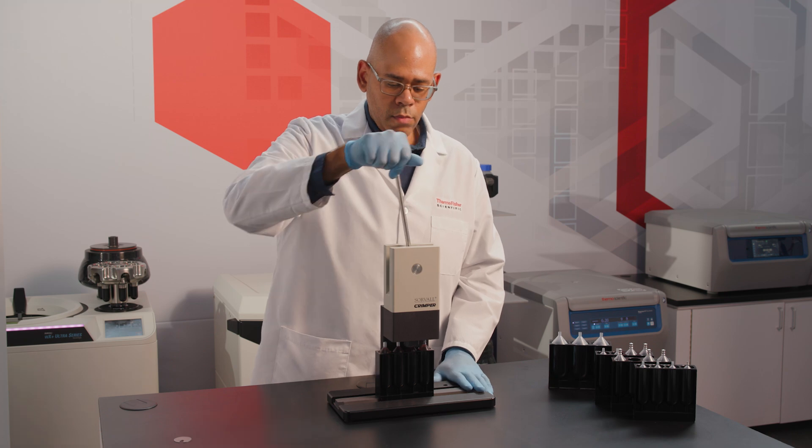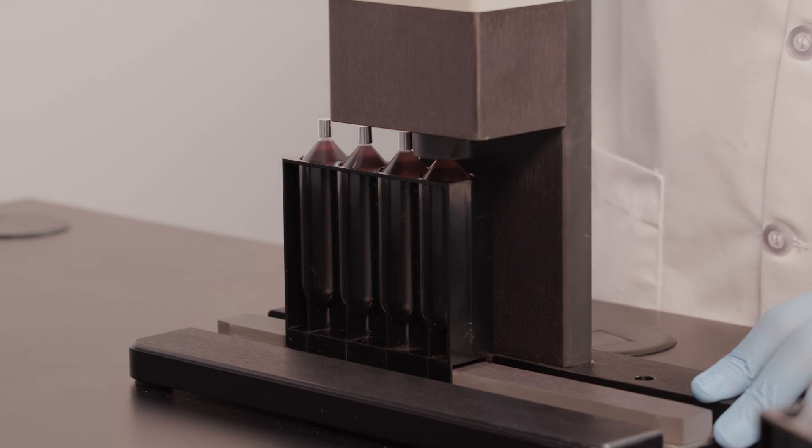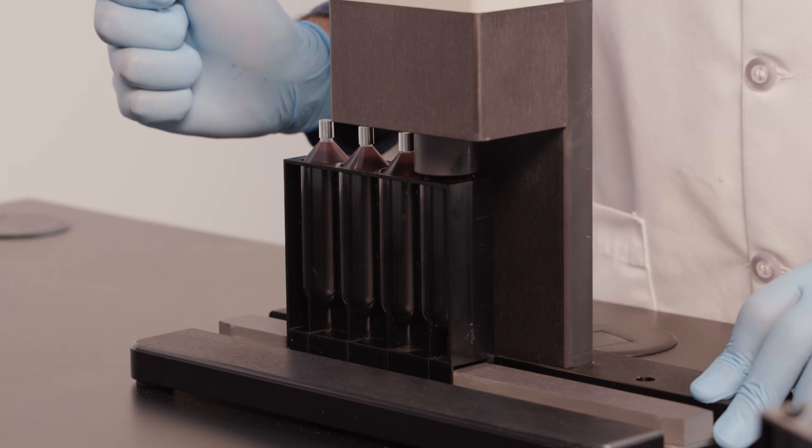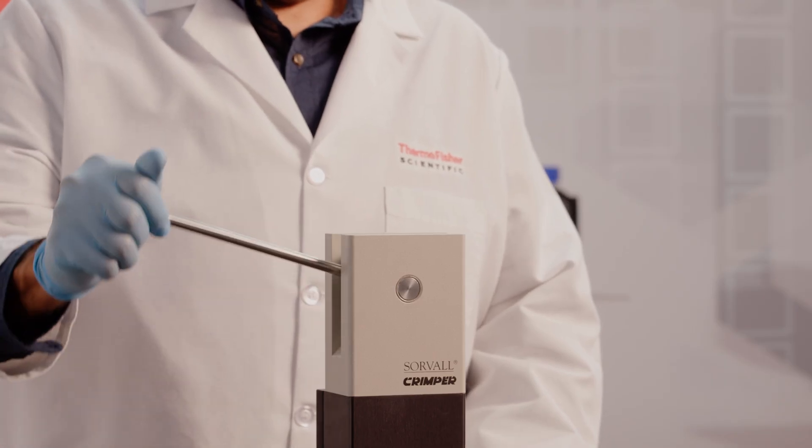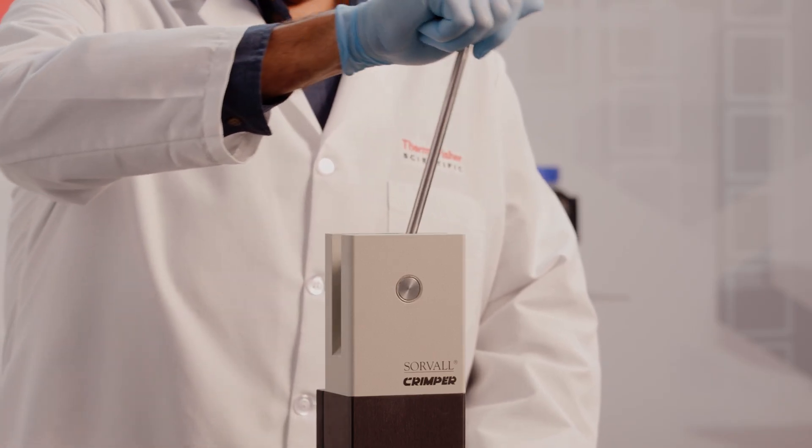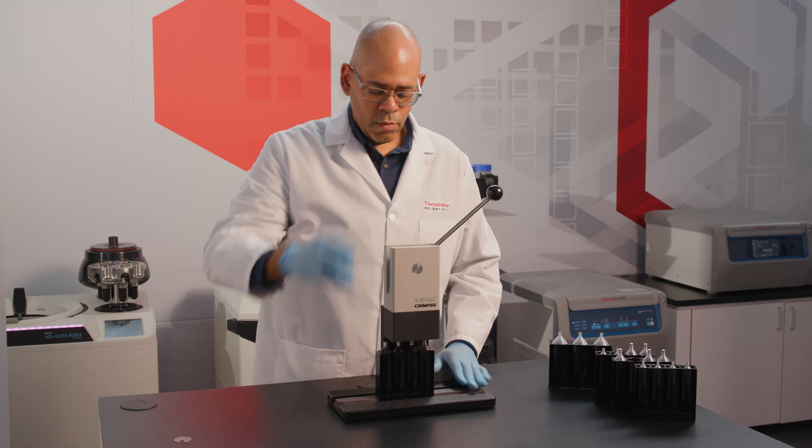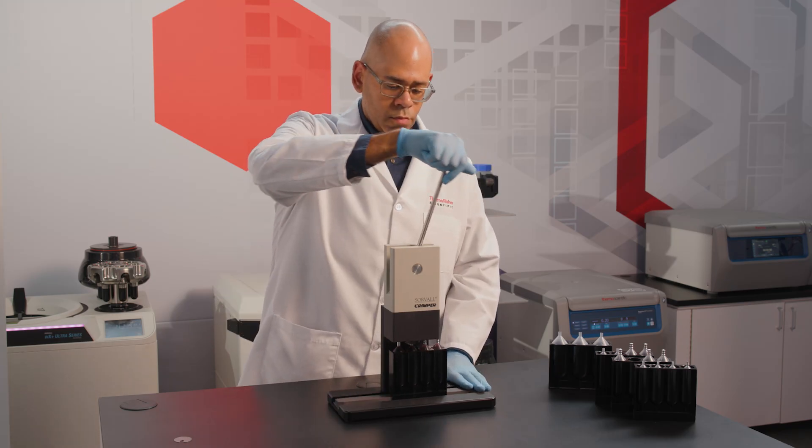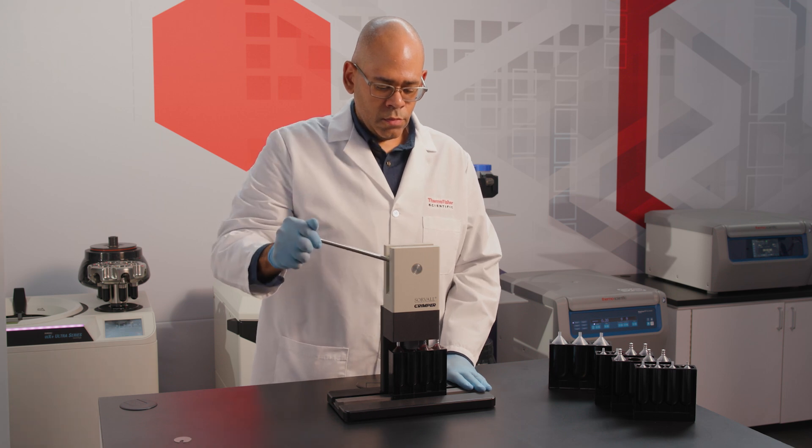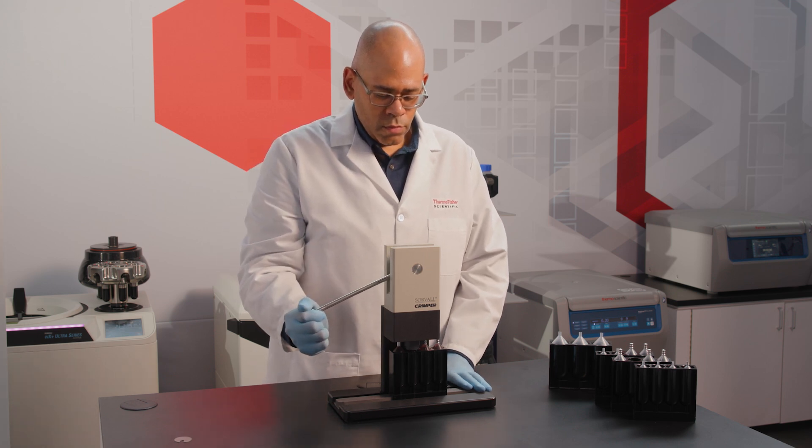Pull the crimper handle down until it comes to a firm stop. When the tube has been sealed, do not release the handle, but gently return it to its original position. To avoid injury, keep your fingers away from any moving parts and maintain your hold on the handle throughout the sealing process.